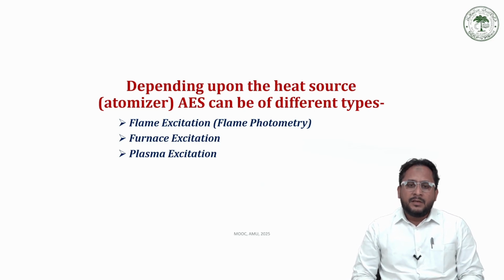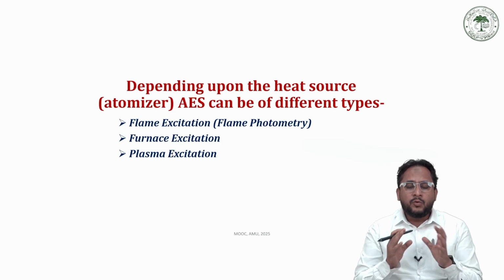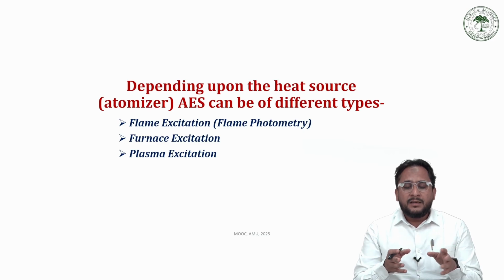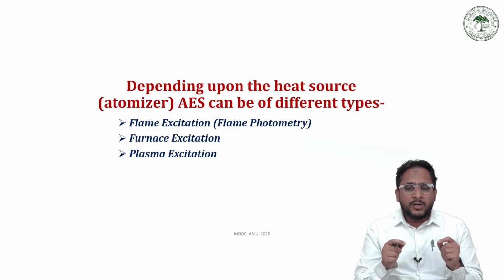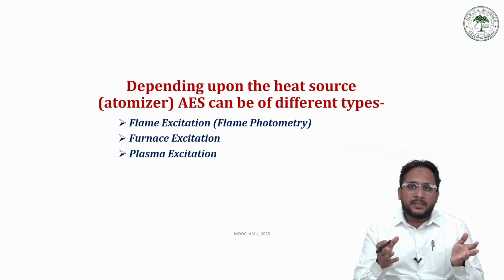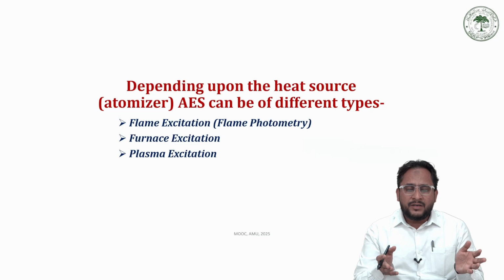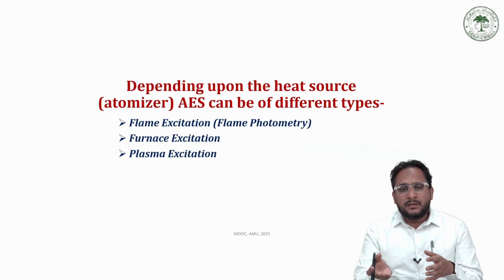Now, in the discussion so far on atomic emission spectroscopy, we realize that no light source is used, which means that the excitation will not occur by absorption of light. Then what are the other modes of excitation? The other mode of excitation left is heat, or thermal energy. So since we are not using light radiation, we are using thermal energy or heat to excite the samples.